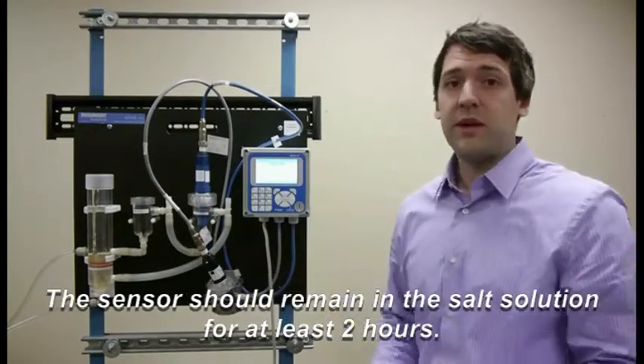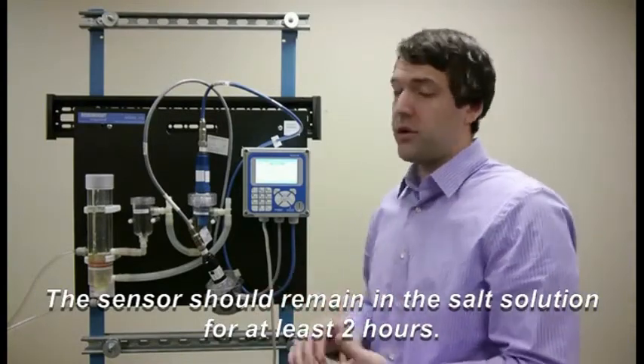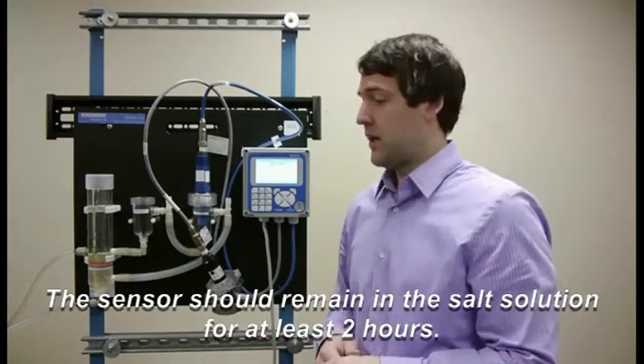We recommend that you do this maybe at the end of the day, then you come back in the morning and you're able to have a solution that's ready for you and you can then zero the sensor.